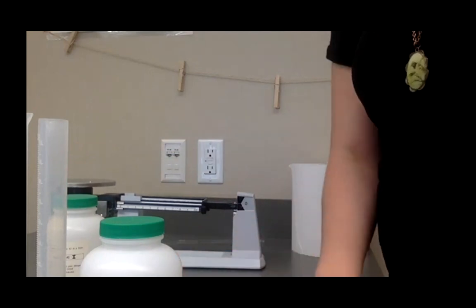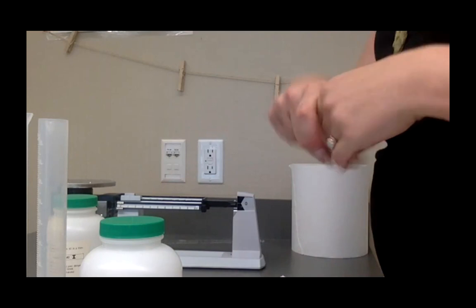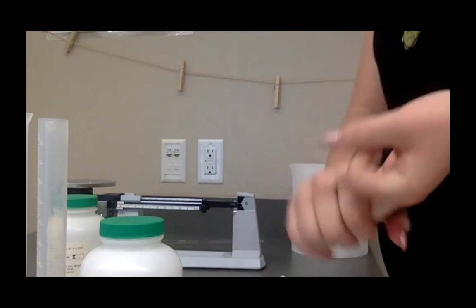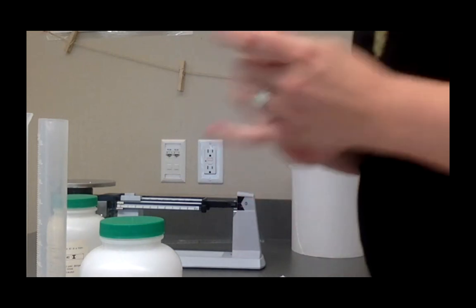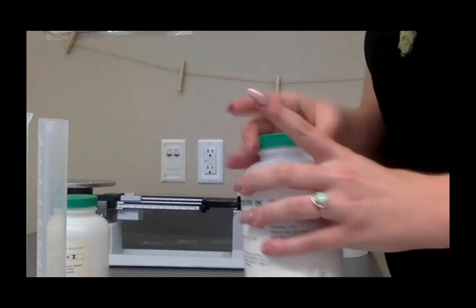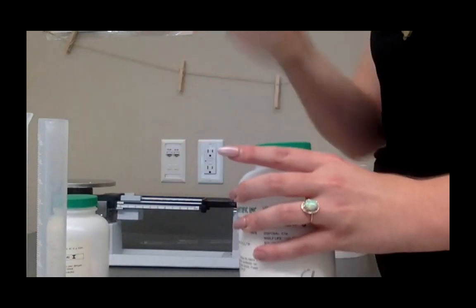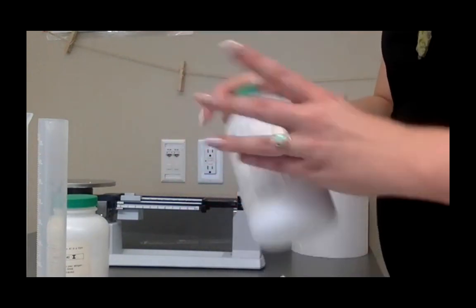So people at home, you're going to be watching as we measure, and you could be calculating the molar mass of calcium chloride, glucose, or water, because that would be really helpful to us when we're done with the measuring. So all you're going to do is use a periodic table, Google periodic table, find one, and look up the atomic mass, which is the same thing as the molar mass, and start adding.